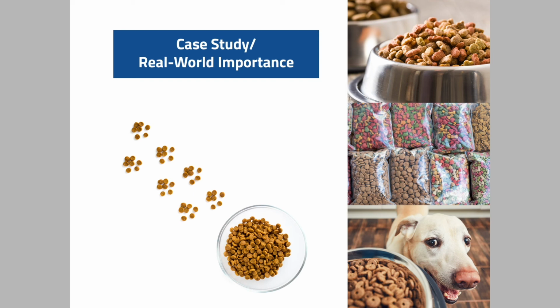What happened then is we used some quality control material to use as their training sample. They used this on both the lateral flow and ELISA type kits that they used on incoming product. In addition, we prepared a custom quality control material made of a base of their specific pet food that we incorporated a known amount of aflatoxin in. This material could be used on testing of release of their final product into the market. Quality control material was used for run acceptance on incoming and outgoing materials.